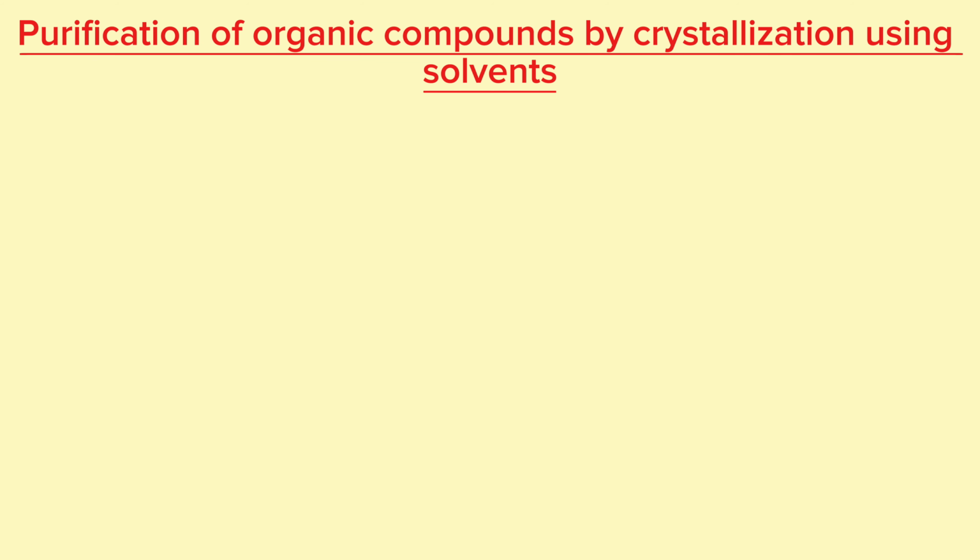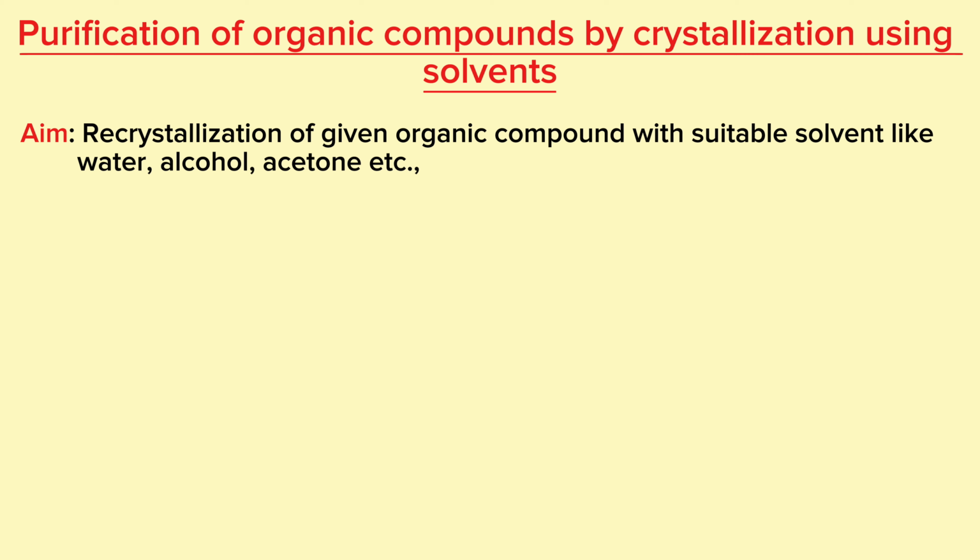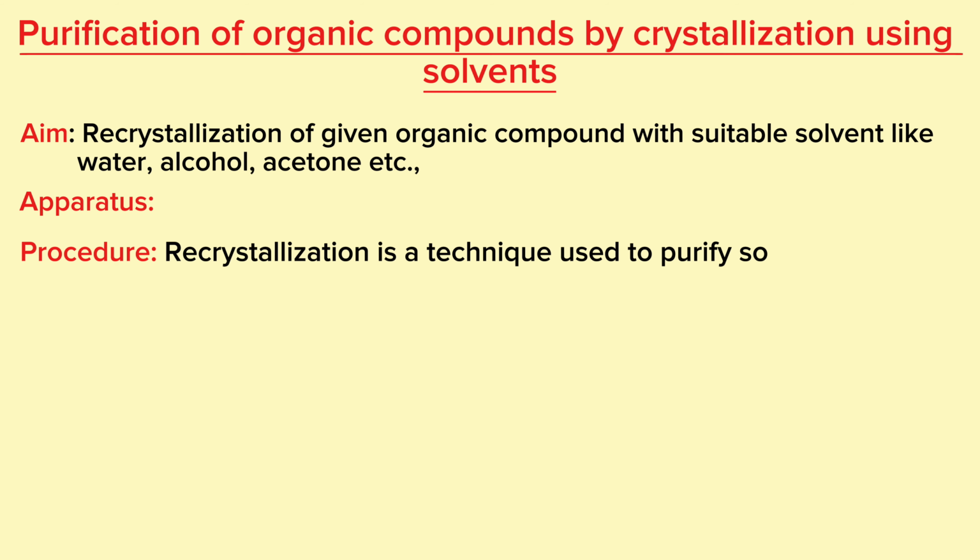Purification of Organic Compounds by Crystallization using Solvents. Aim: recrystallization of given organic compound with suitable solvent like water, alcohol, acetone, etc. Apparatus. Procedure: recrystallization is a technique used to purify solid compounds.